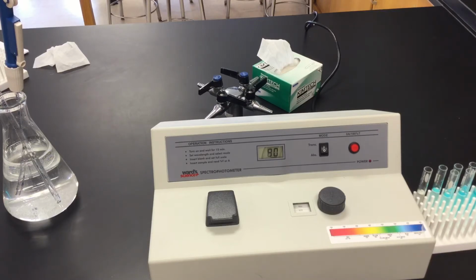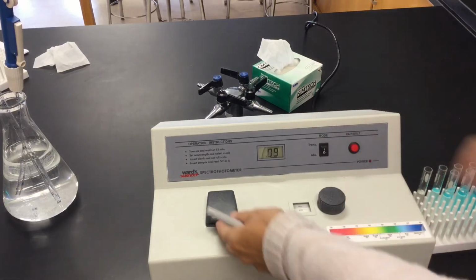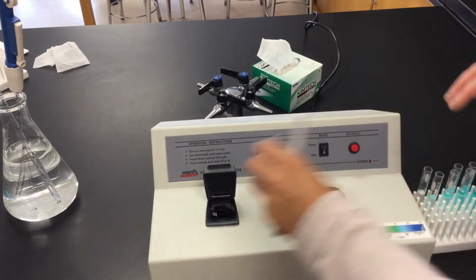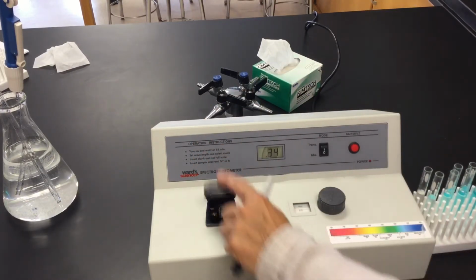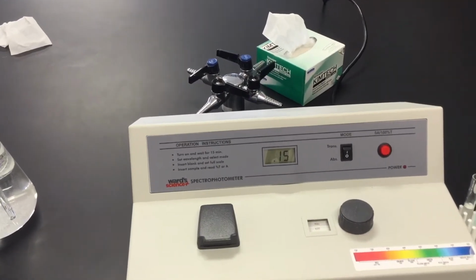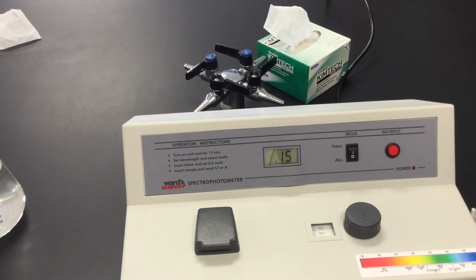That's all we're doing for all 11 tubes. I'm going to go back to absorption. I'm taking out tube number 2 and putting in tube number 3. I am not switching wavelengths here. Why? Because 620 was my maximum absorption for that particular wavelength. Now I'm at 0.15 for absorption. Transmittance, flip the little toggle switch, I'm at 71.